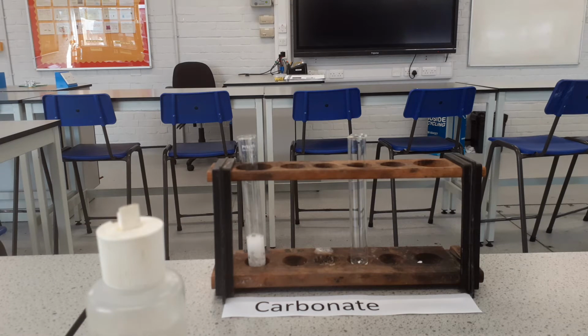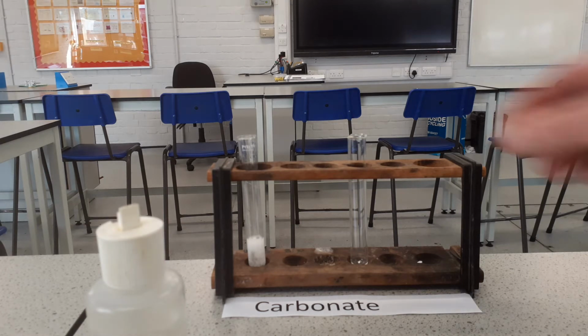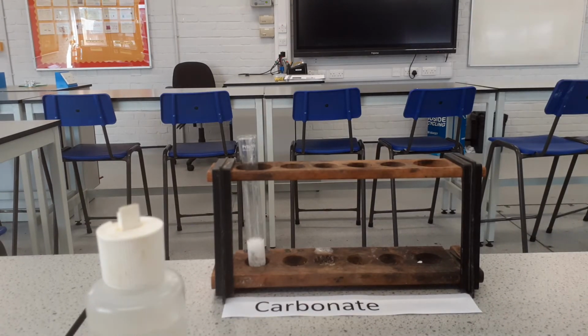So that's one thing. The second thing then, that gas is actually carbon dioxide. So what we have to do is prove it.